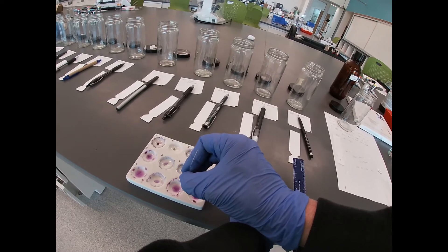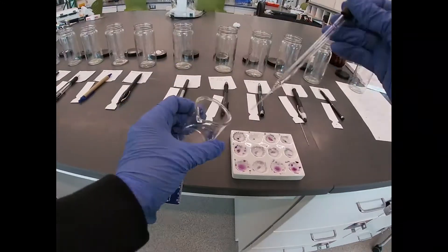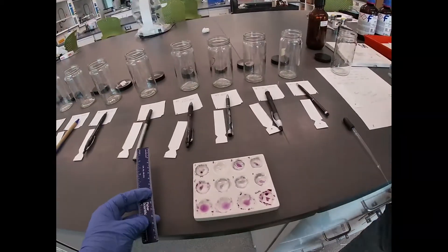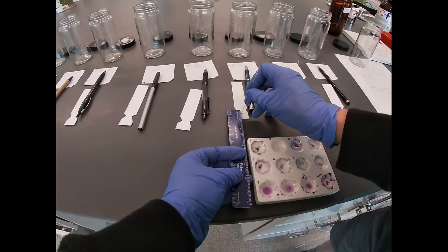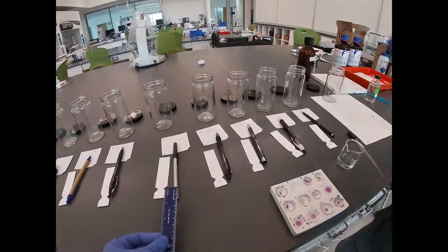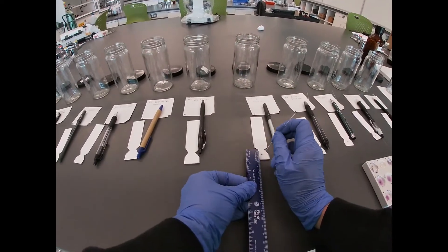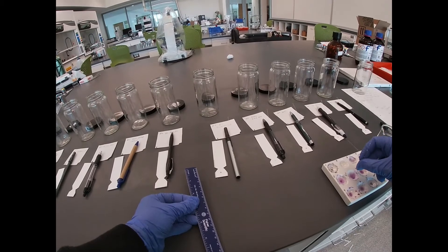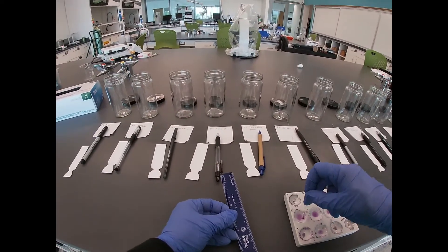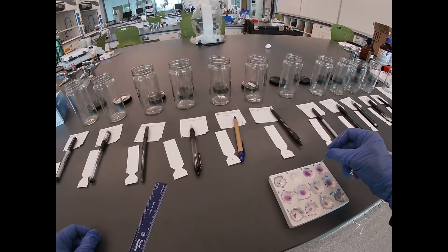I'm not sure why a lot of these migrated up toward the top — it's a little bit weird. We're going to get some more sample from several of these and re-spot them.